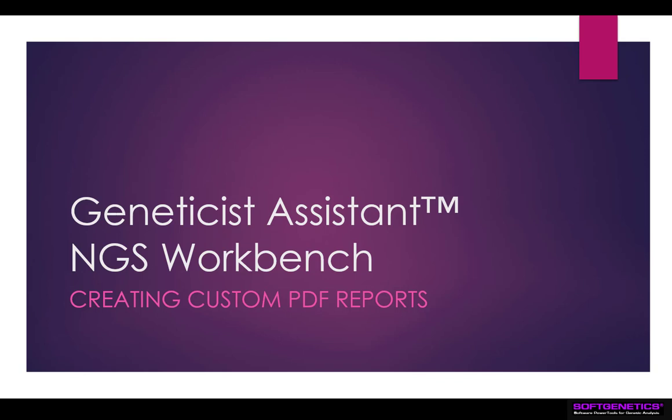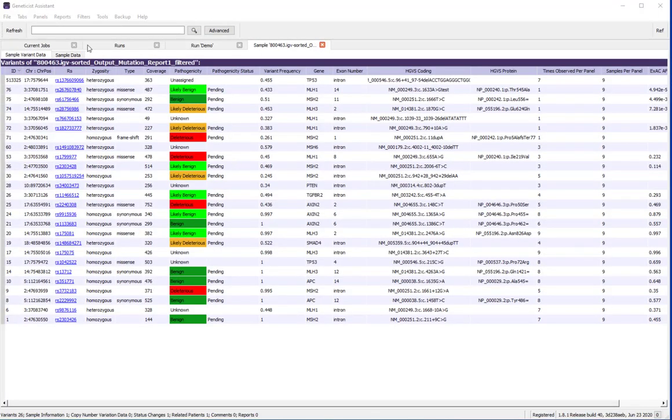Thank you for viewing this webinar on creating custom PDF reports with Geneticist Assistant. We'll cover creating a custom PDF report template with the PDF Report Designer and saving PDF reports for individual samples or in batch. The PDF Report Designer can be accessed from the Reports menu when viewing a sample tab.